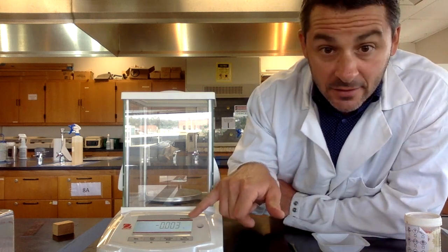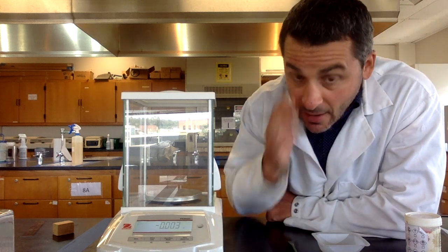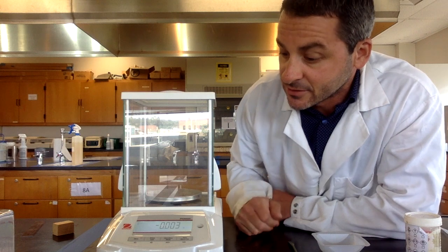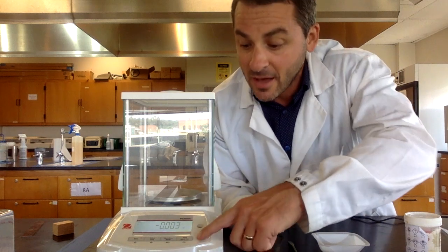The first thing you see here on the balance is the weight on the balance. We usually weigh things out in grams and you see it says negative, which is not usually a good thing. There's nothing on there. We want it to weigh zero. So in order to do that, you can hit the zero button on the balance and now it says zero, which is a good thing because nothing is on there.